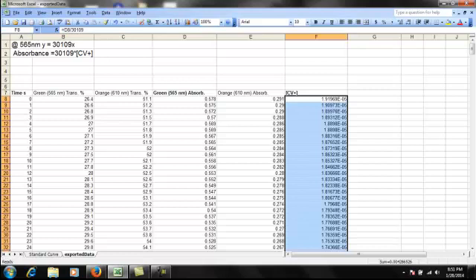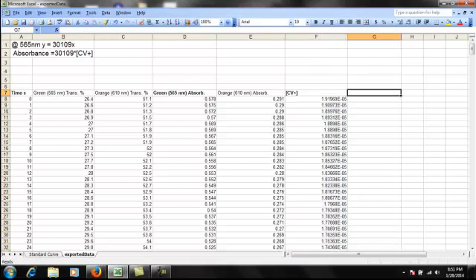So I can do similar transformations here, because I want to make 3 graphs. I want to plot concentration versus time, and I want to plot natural log. I'm going to make this bold also. I want to make this natural log of the molarity of CV plus, okay? And then over here, I'm going to make 1 divided by molarity of CV plus.